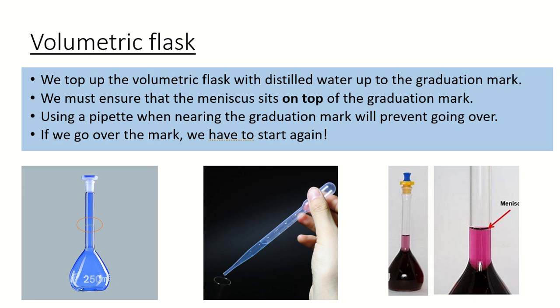I think basically that's what I've just said. You can see the mark on the bottom left circle, that's our graduation mark. Pipette used to make sure we don't go over the meniscus, and then finally the meniscus shown there on the right.